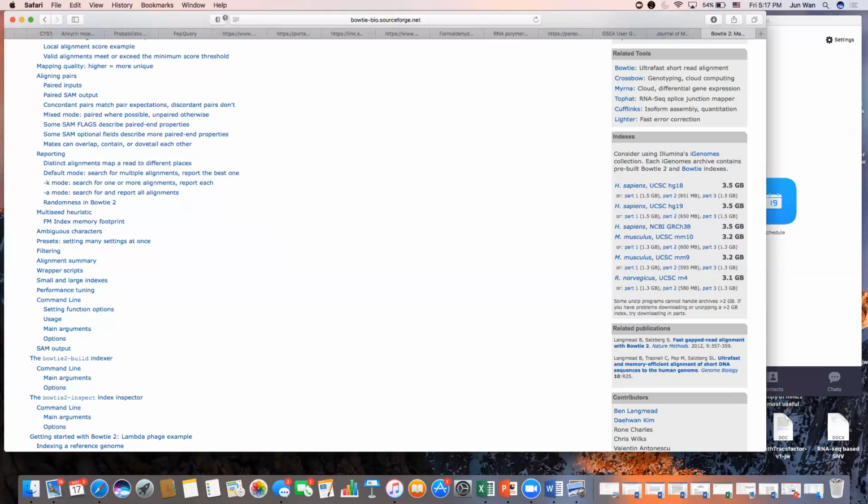.bt2. When you create that index and bring it into your working directory, it has to be able to find your index. I named them using that BT2 part, the .bt2. It doesn't want any of that. What it wants is the part up until the .1. So if you call it MM10, if you call it BT2, whatever you call it, do not put anything after it, okay?